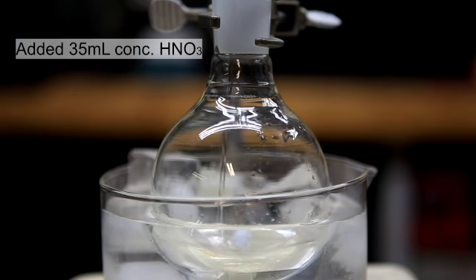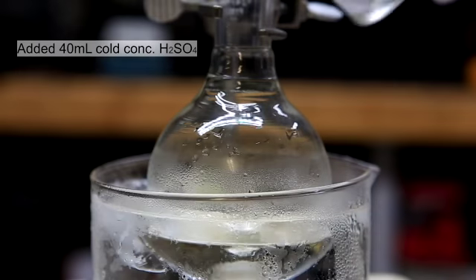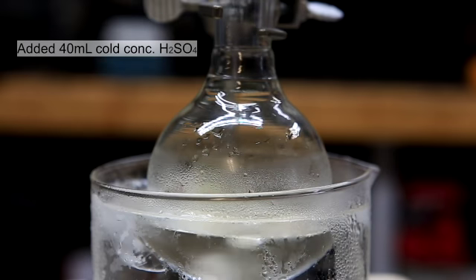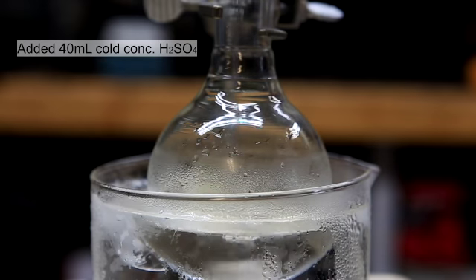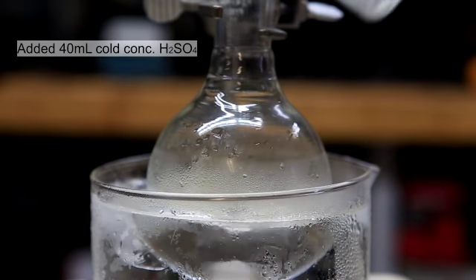35 milliliters of concentrated nitric acid was added to a round bottom flask. With stirring, 40 milliliters of cold concentrated sulfuric acid was added. The sulfuric acid was cooled by putting it in a freezer for about 30 minutes.